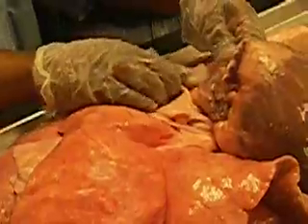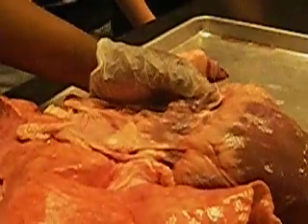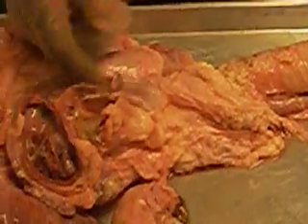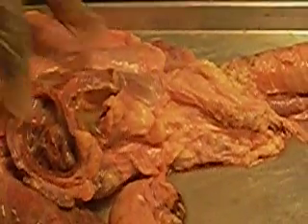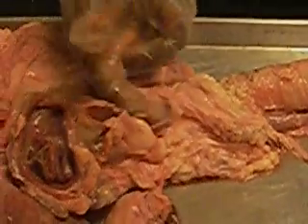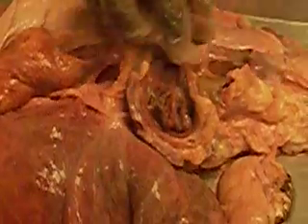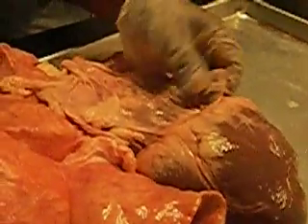You see this one here? That is the superior vena cava. Down here is the inferior vena cava. These two will go to this one here. If you look at this one here, look. See that? That is the superior vena cava coming down. We have removed the heart from here to expose these blood vessels. So if we remove this heart, this is what you're going to see. So that's the superior vena cava. The inferior vena cava comes from down, and those two join together into the heart. Which part of the heart? Right atrium.